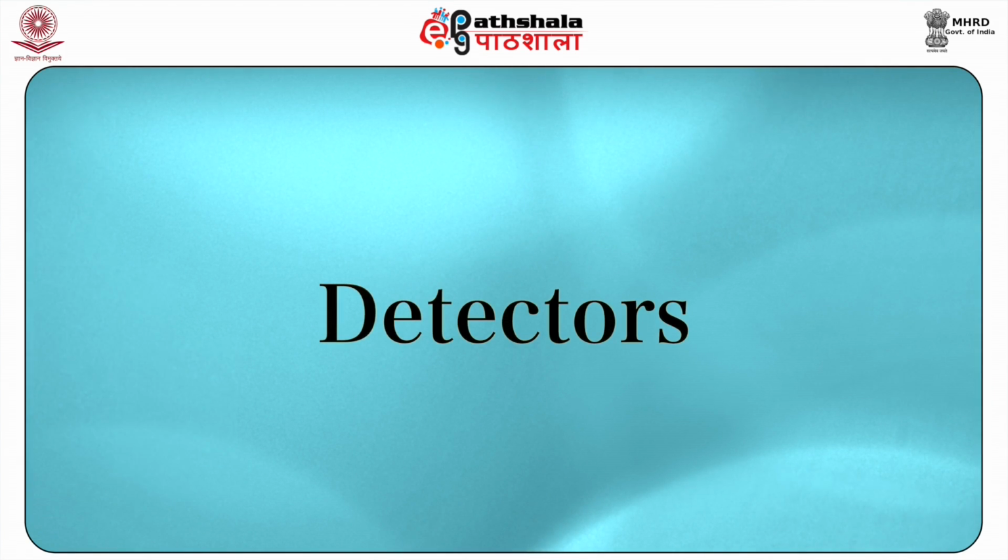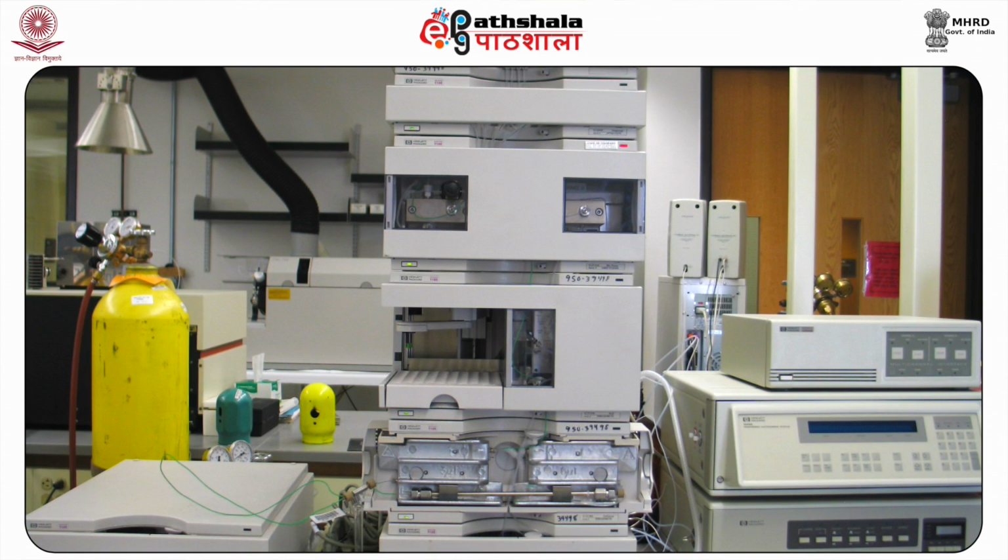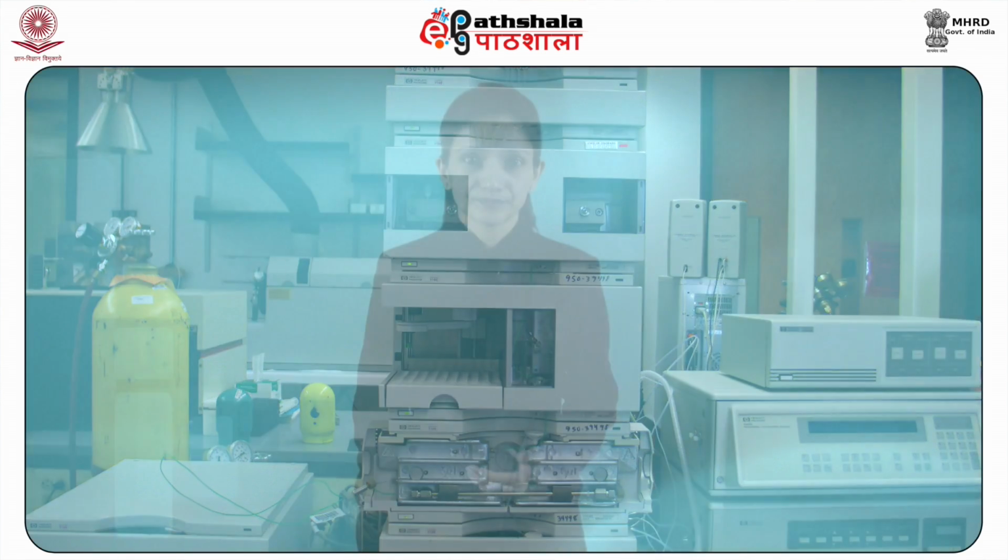Next are the detectors. In case of liquid chromatographic systems, optical detectors are usually employed. These detectors pass a beam of light through the flowing column effluent as it passes through a low volume flow cell. The variations in light intensity caused by UV absorption, fluorescence emission or change in refractive index, depending on the type of detector used, from the sample components passing through the cell are monitored as changes in the output voltage.